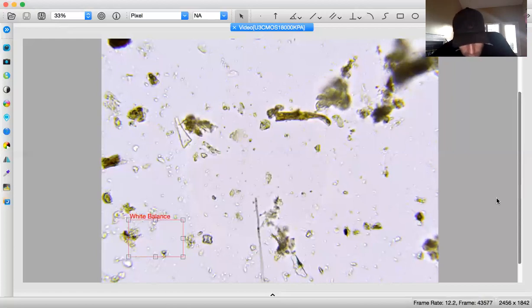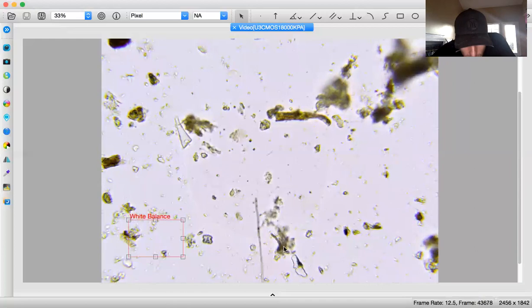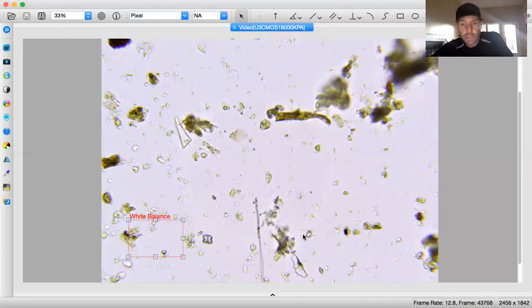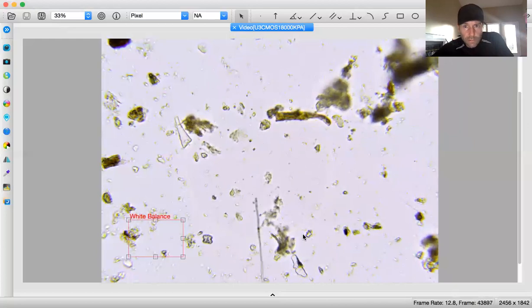And this actually looks like something a little bit more beneficial, but it is so hard to make that out. I can't really tell, and it looks like it branches in a funky way, so I'm just going to call it organic matter. Not seeing anything else to record in space. So moving on.